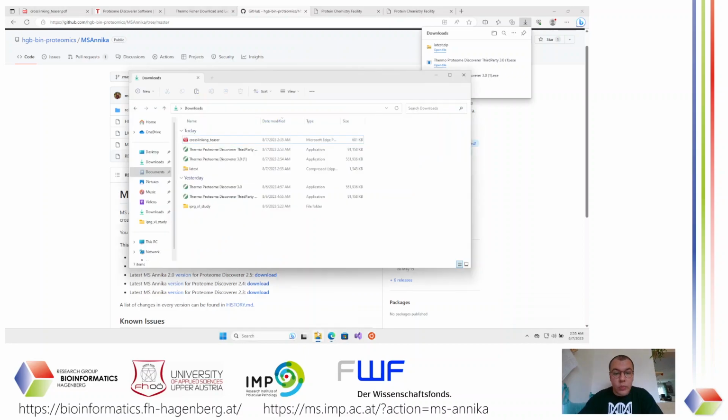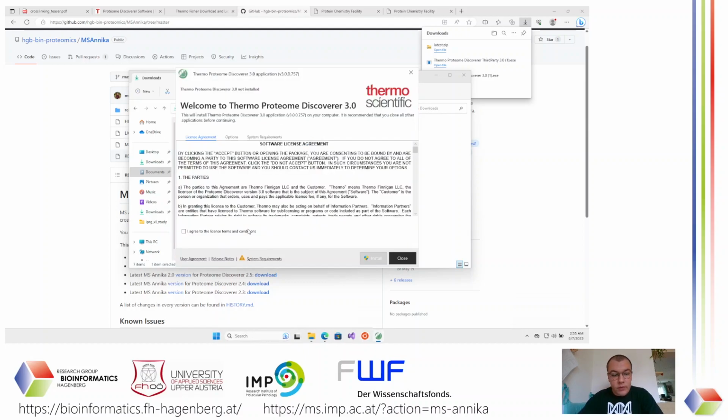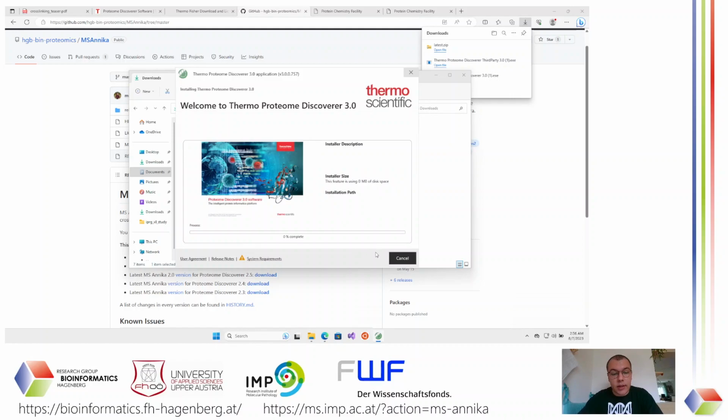So first of all, we want to install Proteome Discoverer. For that, we just open the installer, which will probably take a while. This is a big program. You just agree to the license terms. You will need administrative privileges on your PC to install this.